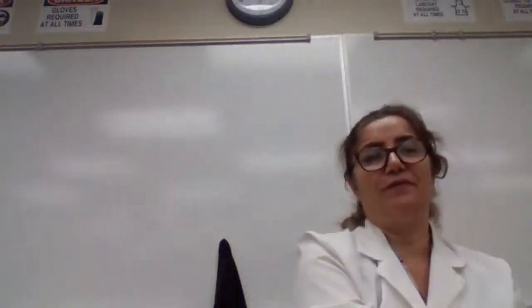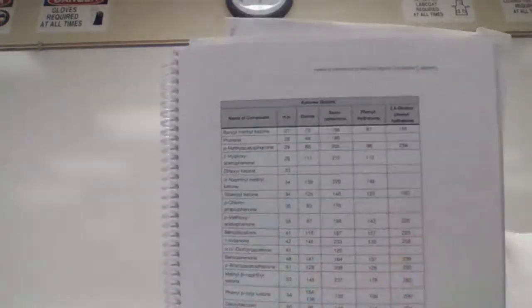And if the melting points are too close, then you have to do derivatization. Derivatization is like changing the compound to another functional group. But since your base compound is known, just like what you did in experiment 12, you can map it back to the original compound. We have a few choices for derivatization, and we have to pick properly which derivatized compound we are going to use.